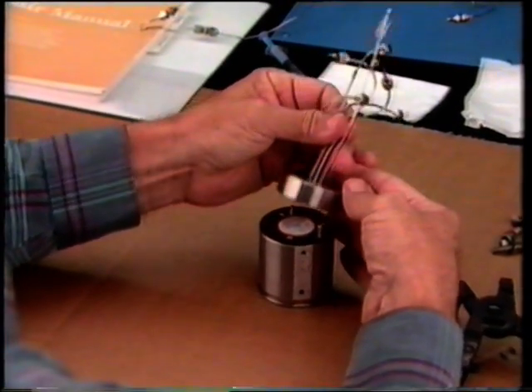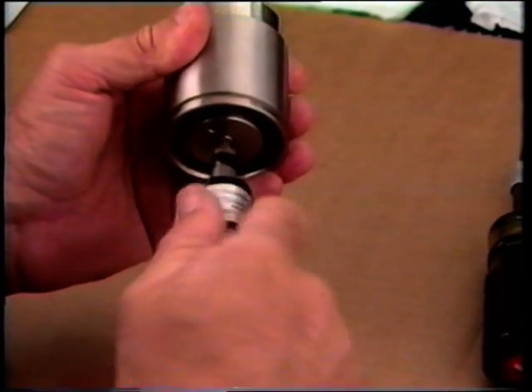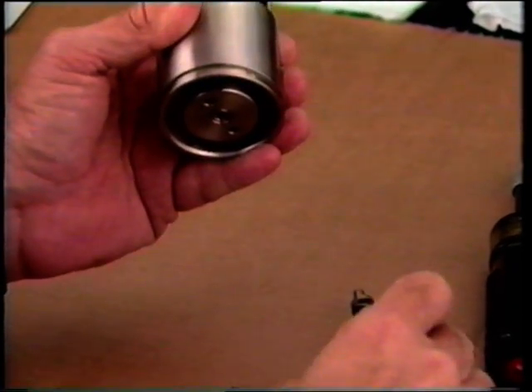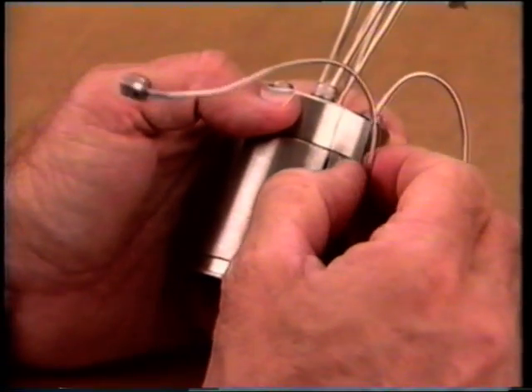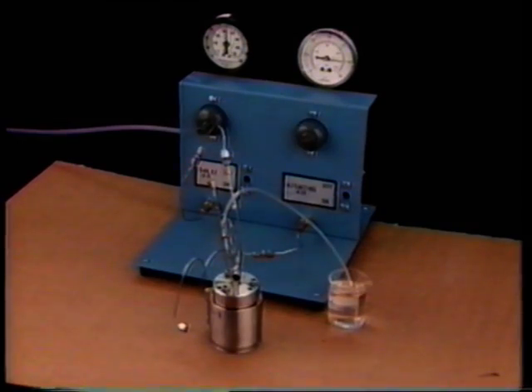Align the valve body and cap and replace the cap screws. Adjust the base screw to give proper spring compression by turning it clockwise to a torque specified by the manufacturer. Reinstall the retaining ring and the manifold with 2 O-rings. Conduct a bench leak test. Once you have verified proper operation, the valve can be reinstalled.